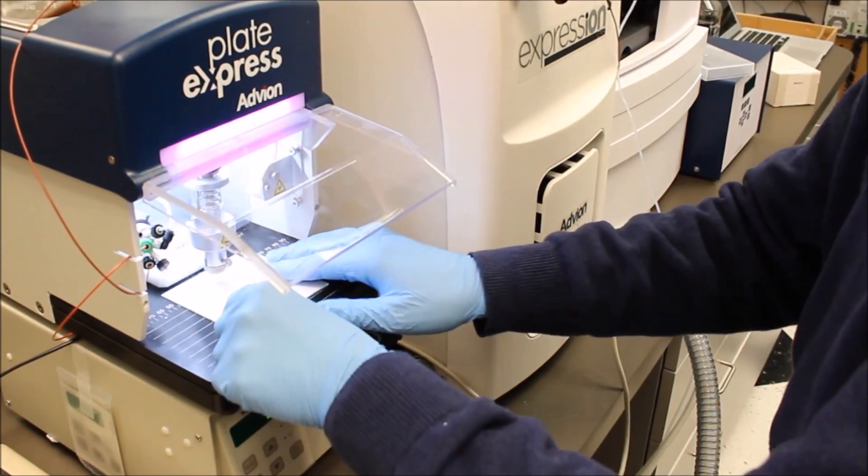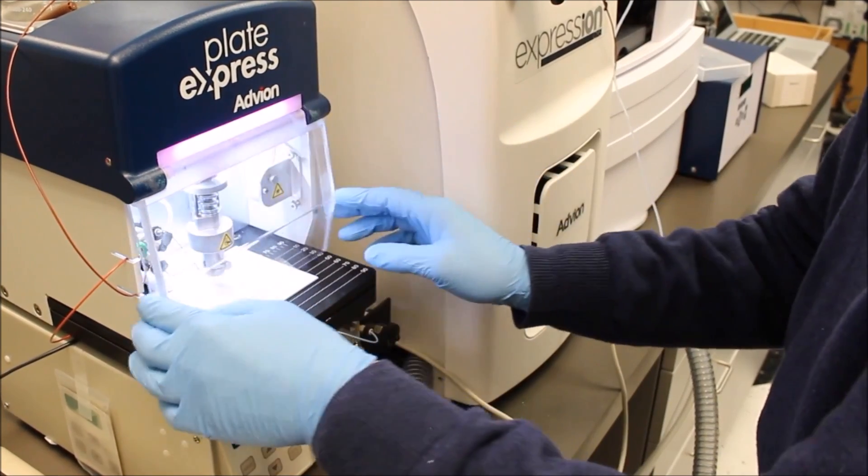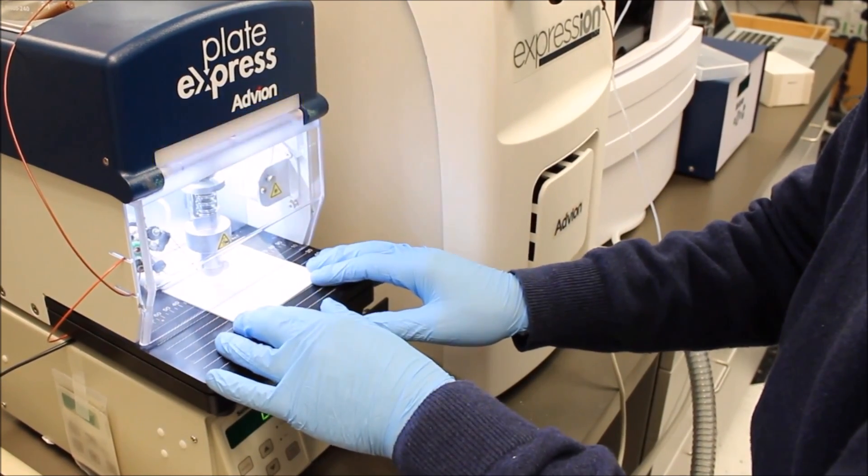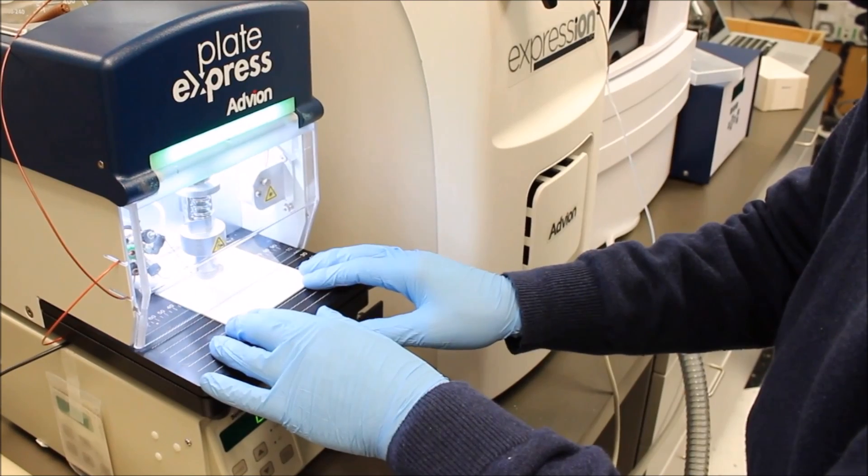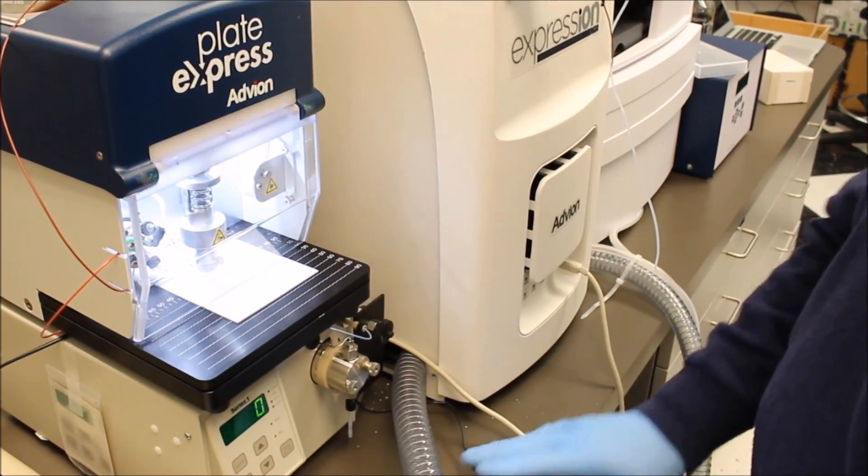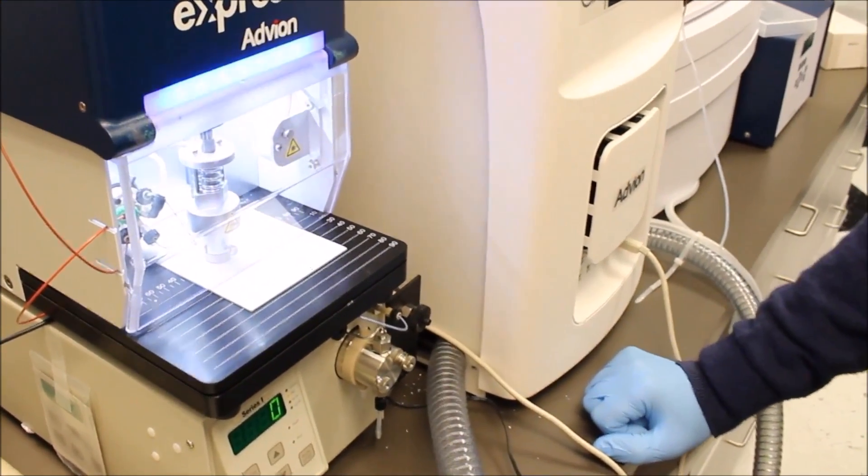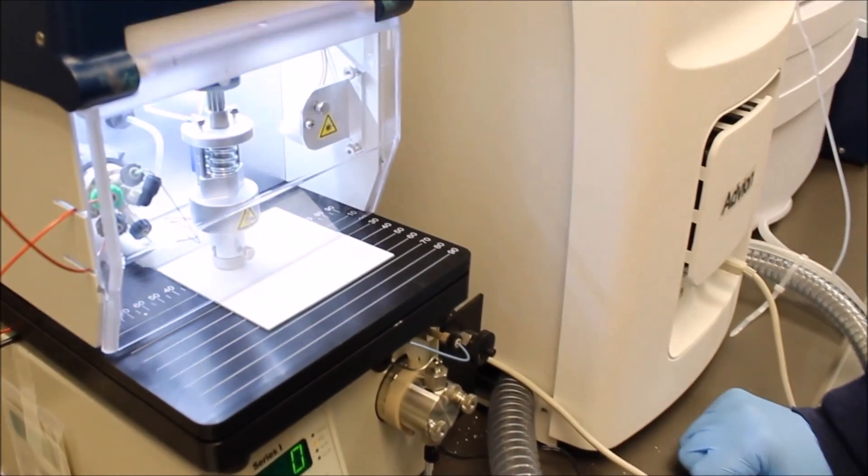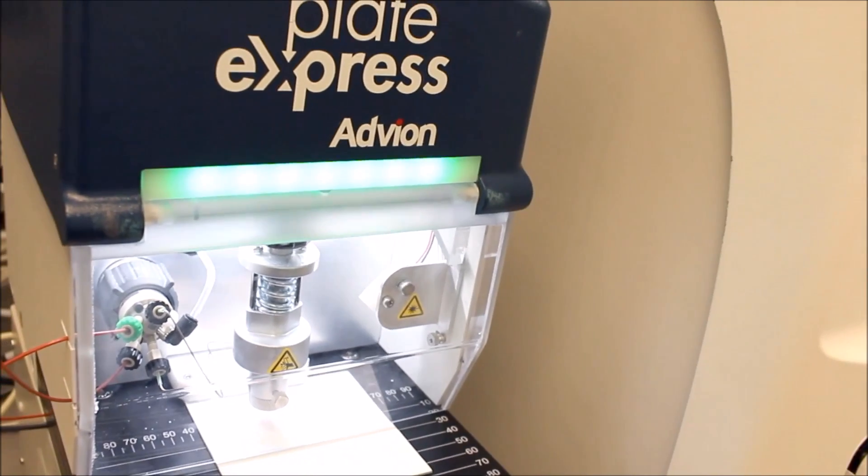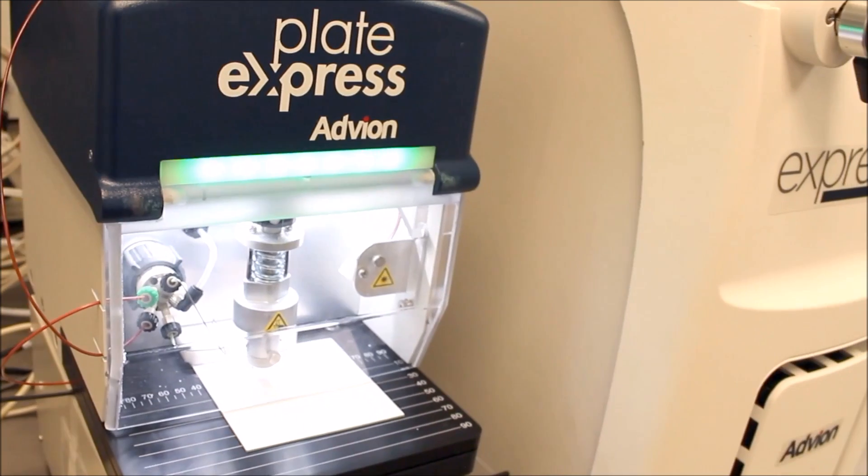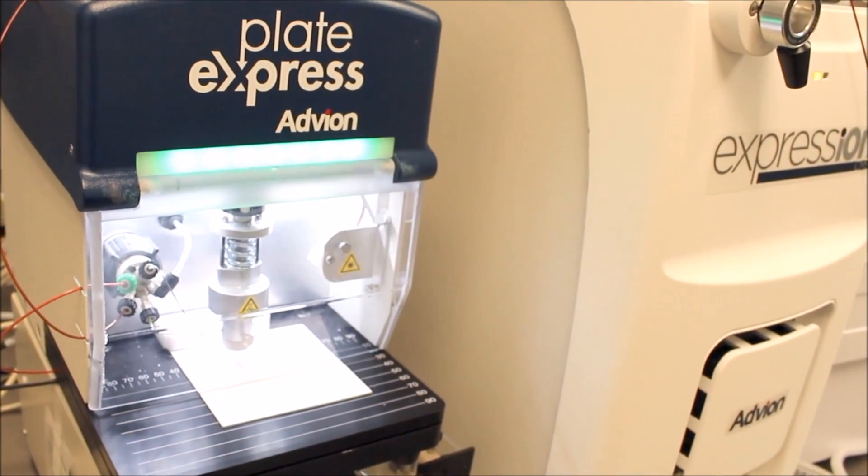And it's as simple as that. Place your developed TLC plate into the Plate Express, align your spot of interest using the integrated laser pointer, and press the button to start. The head will lower, seal the spot of interest, and solvent will extract the compounds into the mass spectrometer.